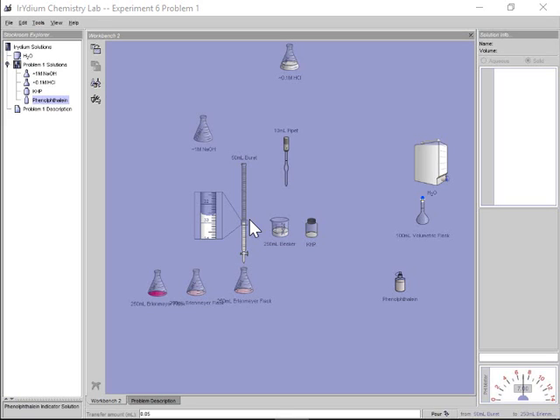What I'm going to try to do in setting up this next part is make sure we have enough NaOH. This is totally a problem that can happen here. We spent so much NaOH. I standardized it. I know this solution is now perfectly 0.92 molar, but I'm realizing, oh shoot, I don't have a lot of it left.